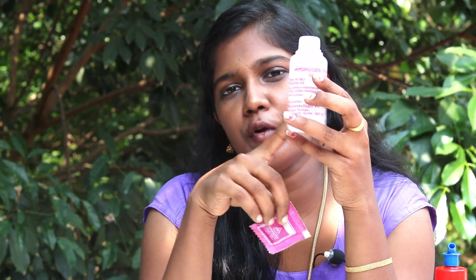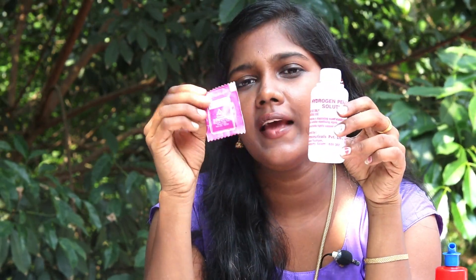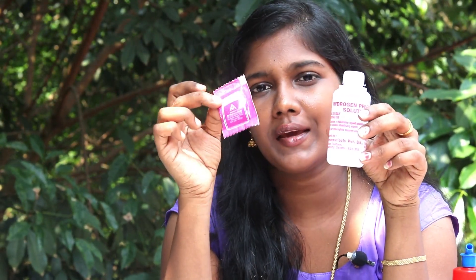I am doing this experiment with potassium permanganate. It has hydrogen peroxide, which is available in all medical stores. It is easy to use.